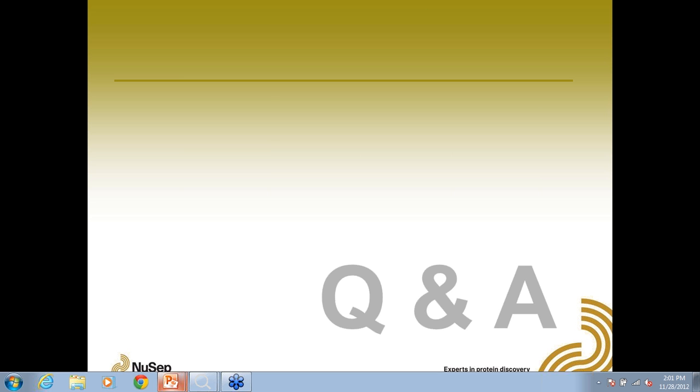Okay, James, I have a question. I have ProteoIQ version 2.3.02 in a maintenance contract. Can I download 2.6 for free? Also, could you send me the file with the slides presented today? That's Eduardo. Yep, everyone's going to get an email with the slides today. And if you have an active maintenance contract, you absolutely can go log into your account, download it.